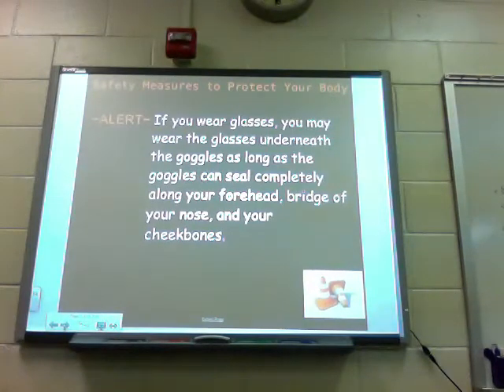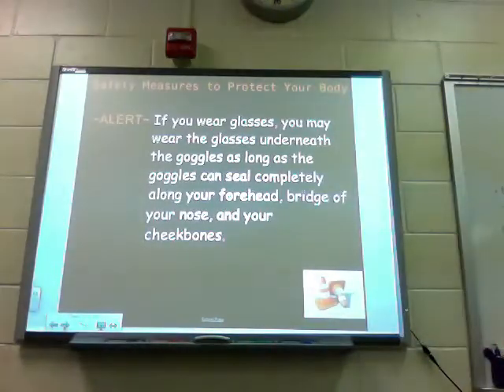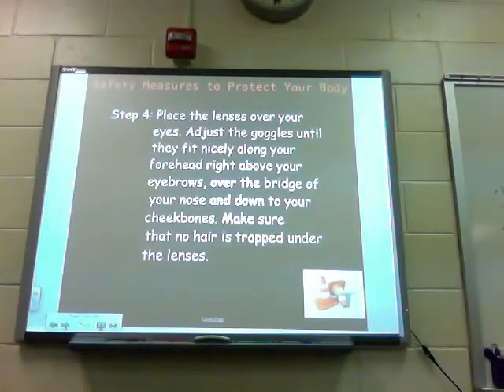Alert! If you wear glasses, you may wear your glasses underneath the goggles, as long as the goggles can seal completely along your forehead, bridge of your nose, and your cheekbones. Step four: place the lenses over your eyes. We're going to show you how to put some goggles on. Place the lenses over your eyes, then adjust the goggles until they fit nicely along your forehead right above your eyebrow, over the bridge of your nose, and down your cheekbones.